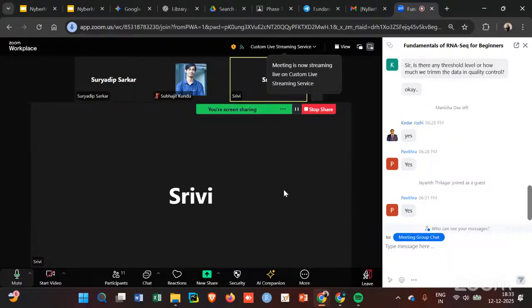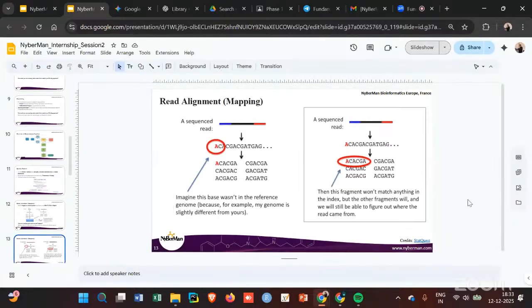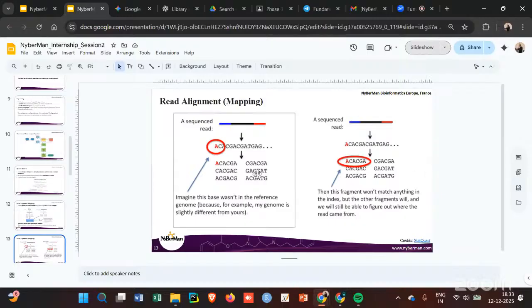Mostly these tools have default mathematical models to actually choose the most optimum k-mer level. A lot of high level statistics goes into it. This is only for an example purpose. People, 6-mers, 7-mers, these are actually very small when you think about the scale. Six is very small as compared to 3 billion, right? So these are only for educational and representation purposes. In reality, you might end up with 30 or 40-mers.